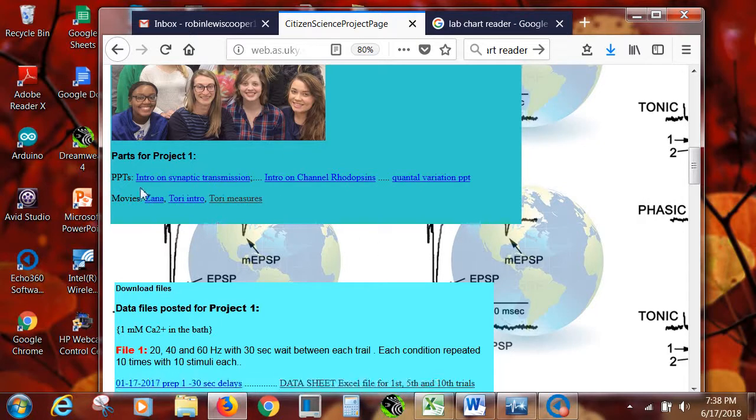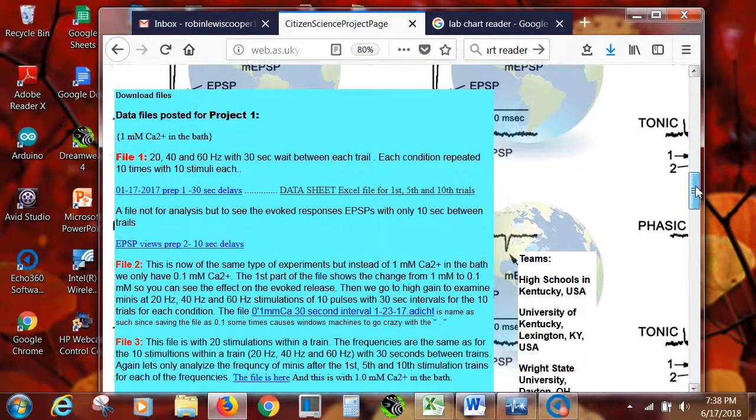The measures that Tori mentioned in here about the details of using the software cover many different topics, but for our purposes, we're just going to count the minis. So this video, I'll put a new one here about just counting videos by Robin. That's me. Okay, so here are the files to download. You'll need to download this file and a data sheet, and then you want to save it under your name so you can send it later.